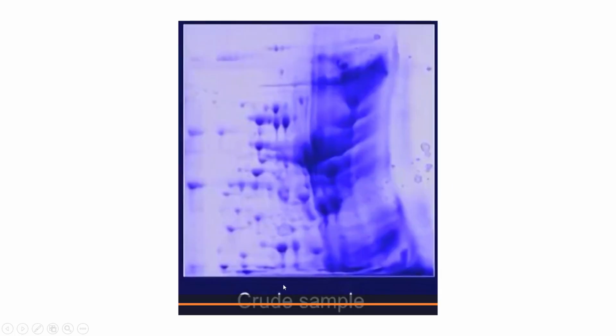Similarly, while making SDS-PAGE, if you haven't used APS properly, the polymerization will not take place accurately, and because of that, the proteins will get separated something like this. And for example, if you are using a crude sample itself and are not fractionating it properly, your sample preparation is not that accurate, you might see a gel something like this. So all those are some limitations or challenges.